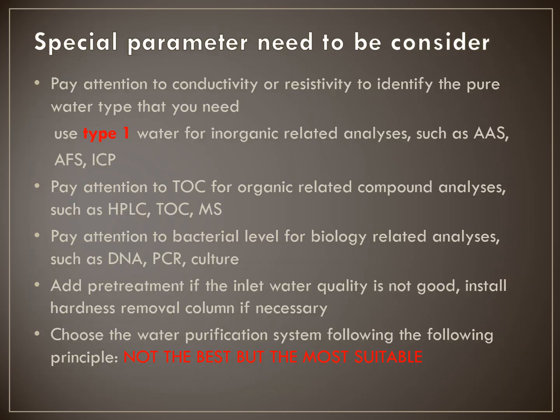After we are clear about our water capacity and the purification level, we pay attention to the parameters we need to consider when we have an instrument description in front of us. First, we check the conductivity and the resistivity to see whether they reach our required standard level.